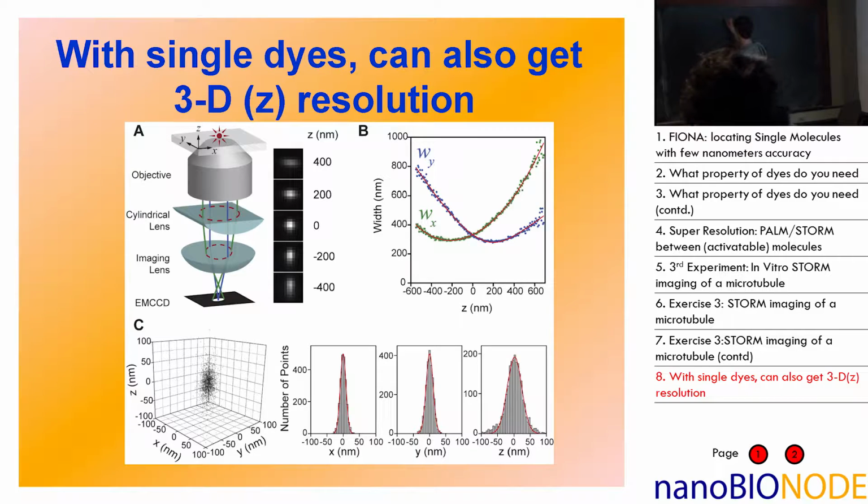Your x in this case will be pretty narrow. It might be the same as the 0 plane. You have your full width at half max. And then the y, by comparison, is a lot more spread out, so you have a much larger full width at half maximum. And then this should be taller than the y counts, just because it's more spread out, but you're going to assume it's the same number of counts coming out for each direction.